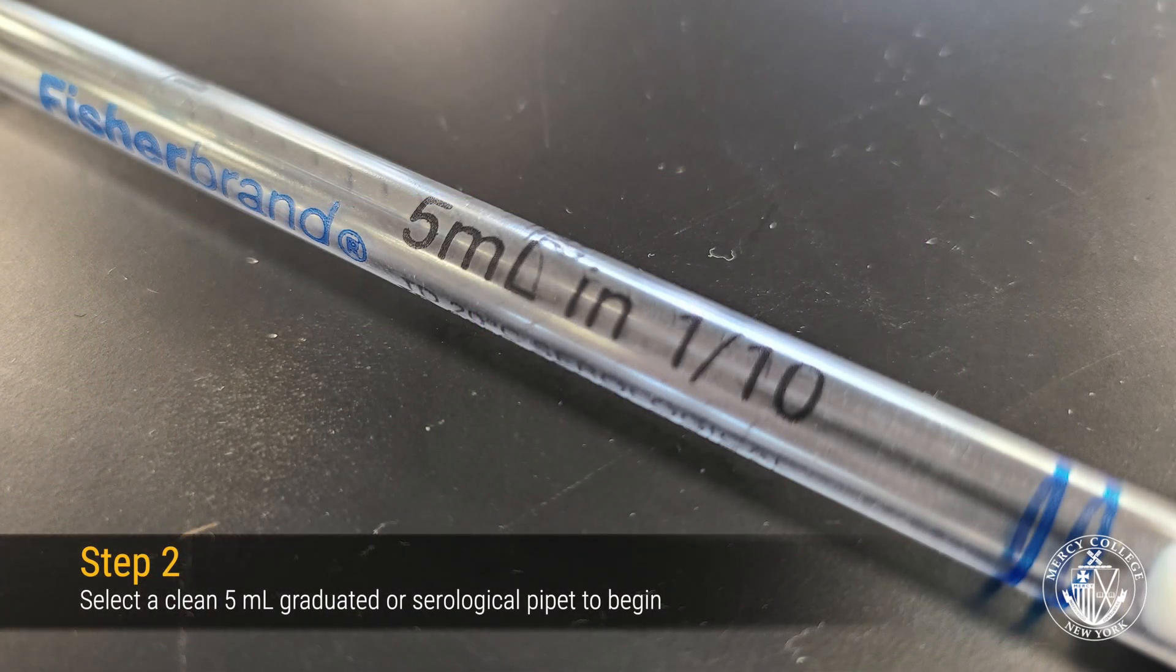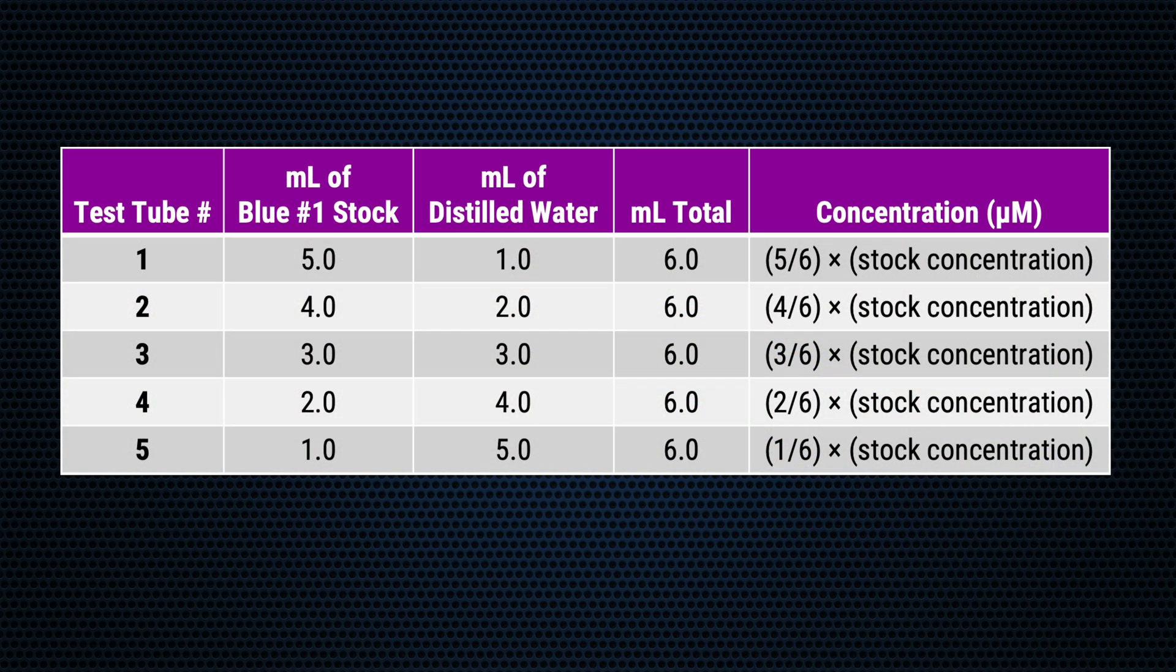Next, we'll use a 5 milliliter pipette to prepare our Beer's Law standards. Use the volumes provided in the dilution table as a guide.